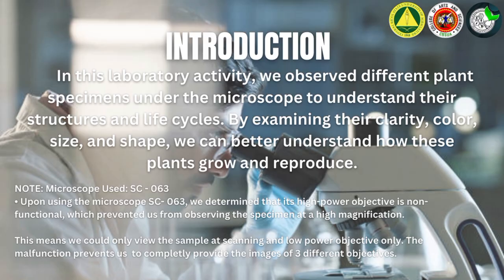Upon examining the microscope we used, we determined that its high power objective is non-functional, which prevented us from observing the specimen at a high magnification. This means we could only view the samples in scanning and low power objectives. The malfunction prevents us from completely providing images of the three different objectives.